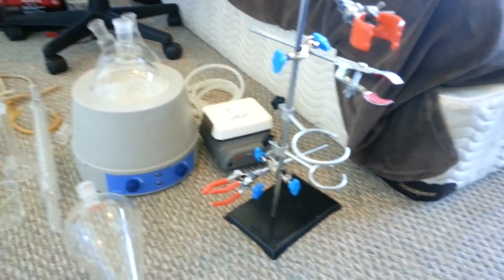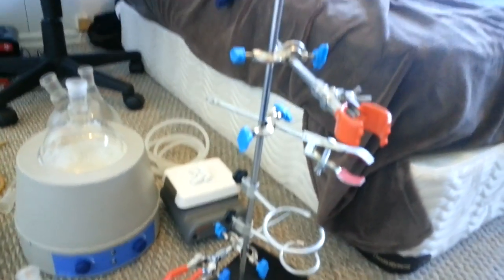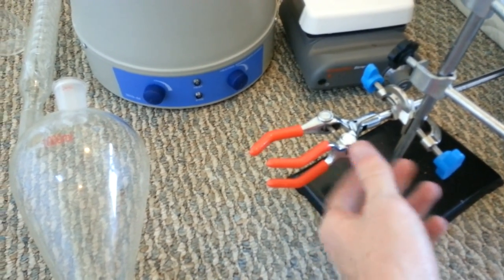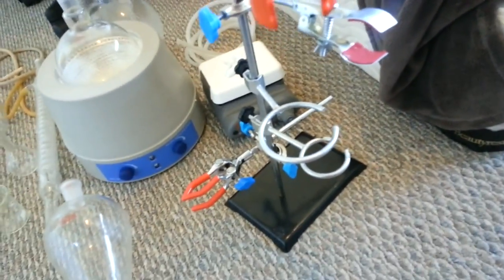This is a stand for holding the glassware together if you've got something heavy. It's pretty much just a heavy metal base with a metal rod and a bunch of fancy-looking attachments. This one right here is my favorite — he's pretty good for holding things together no matter what shape or size they are. You should get one of those. You don't necessarily need one, but it makes life much, much easier.